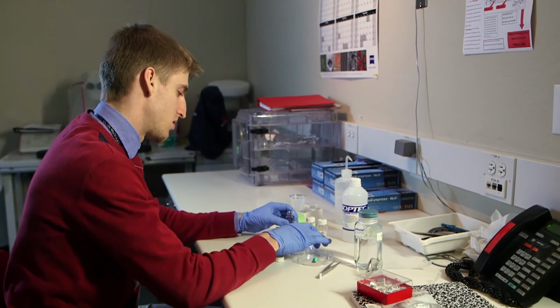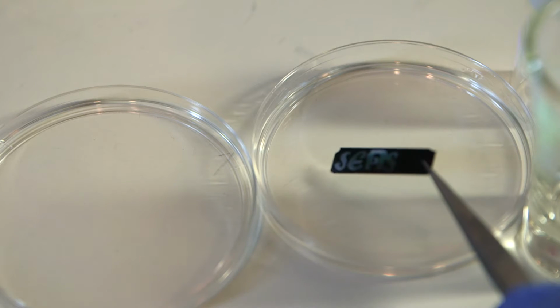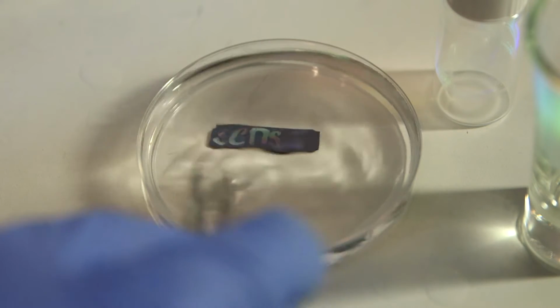I'm working on the development of a colorimetric indicator for liquids that operates based on wetting. In contrast to pH paper, where the color of a particular region changes in response to pH, in our case, it's really a pattern that is appearing. Not only can we control what liquid induces a given pattern, but we can control what those patterns are. And that really enhances the user friendliness. So for example, we can make the word methanol appear in response to methanol.